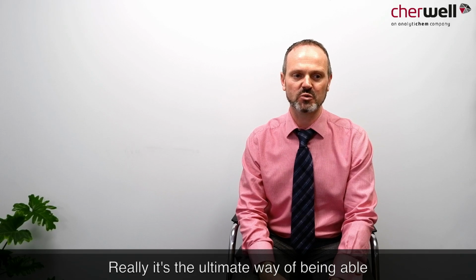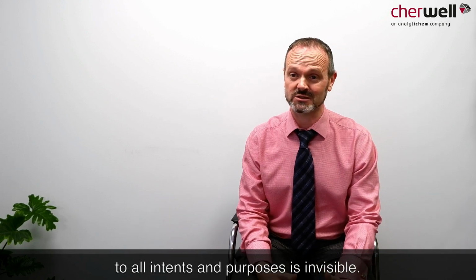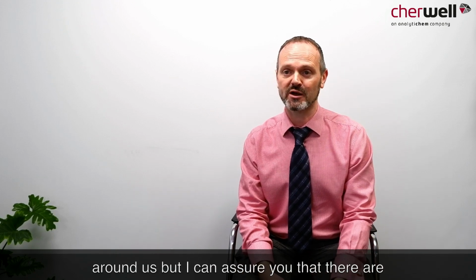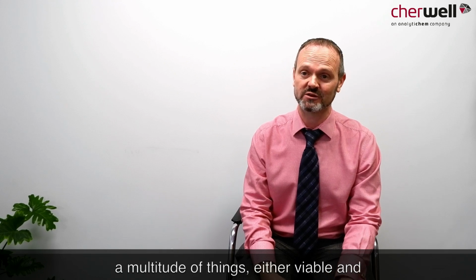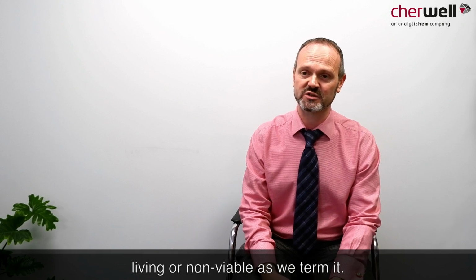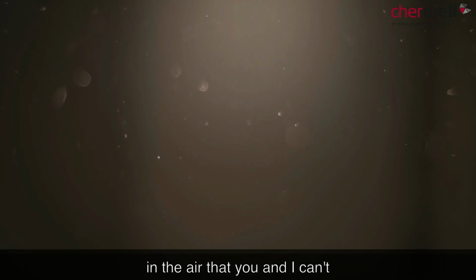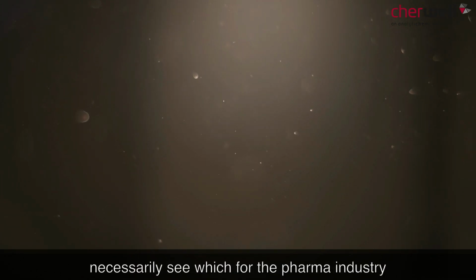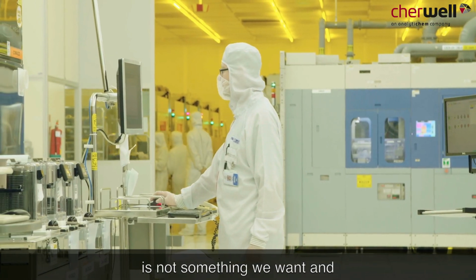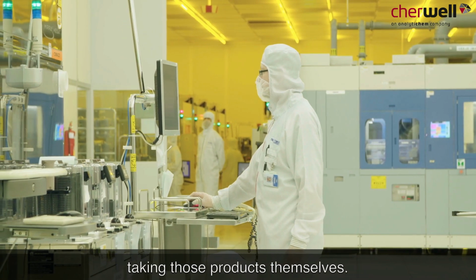Really, it's the ultimate way of being able to visualize something that, to all intents and purposes, is invisible. We don't know what physically is in the air around us, but I can assure you that there are a multitude of things, either viable and living, or non-viable, as we term it. There are hundreds of thousands of particles floating around in the air that you and I can't necessarily see, which for the pharma industry and in a clean room environment is not something we want, and it's certainly not something we want going into our products or into patients that are taking those products themselves.